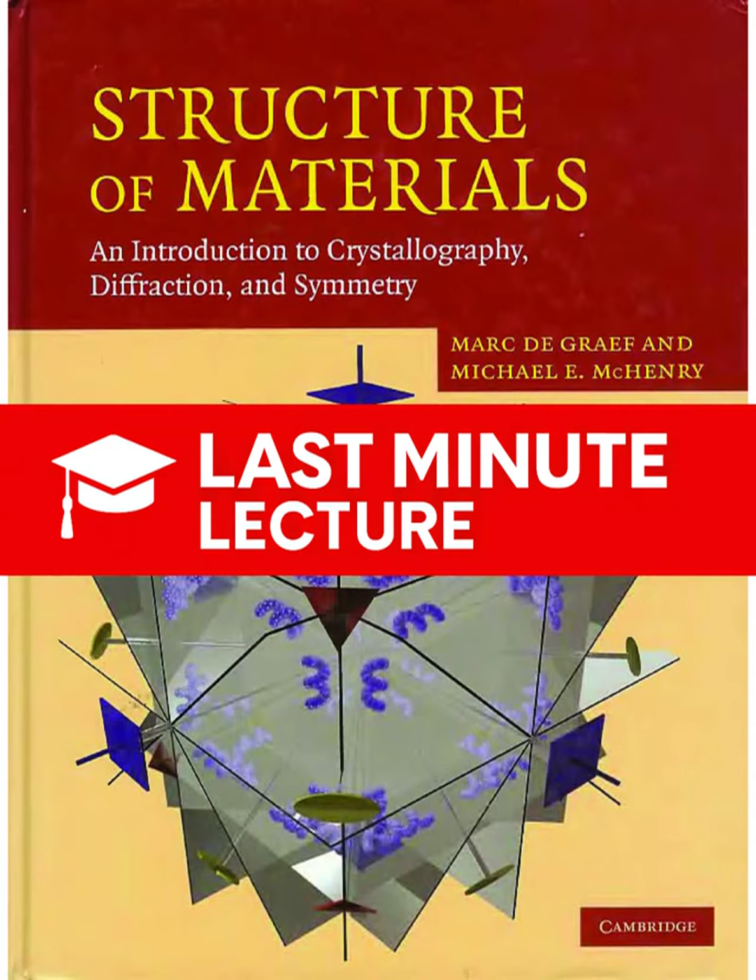Exactly. The outer boundary is defined by the shortest wavelength, lambda min, and the inner by the longest, lambda max. Any reciprocal lattice point that happens to fall within that shell will find its corresponding wavelength and diffract, producing a spot. And the resulting pattern is this complex constellation of spots, which depends entirely on the orientation and symmetry of the single crystal. It's a direct map of the symmetry.